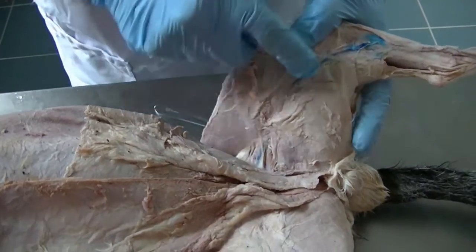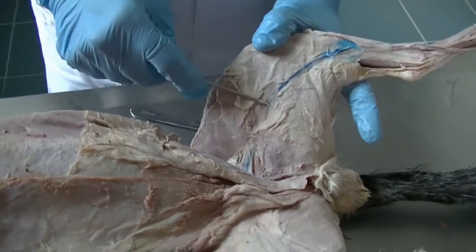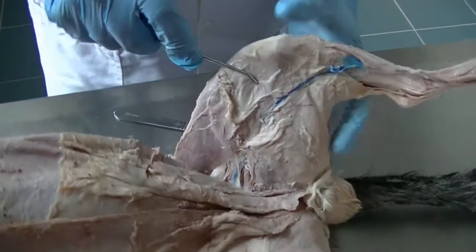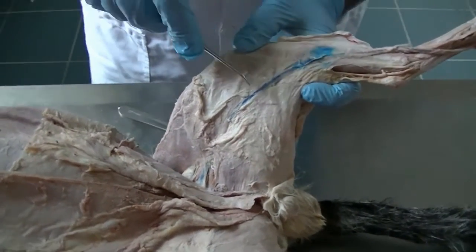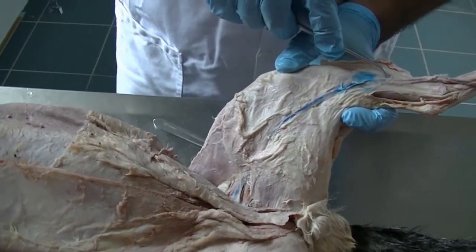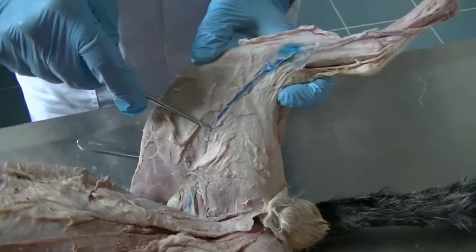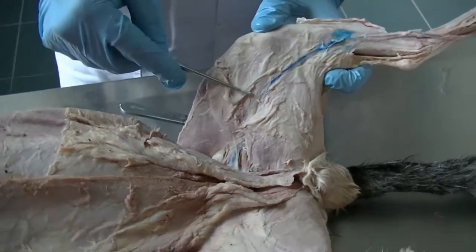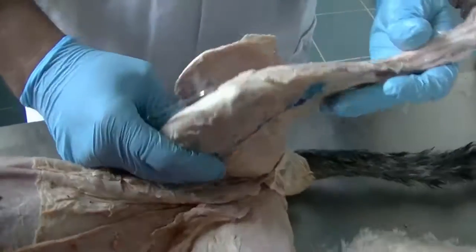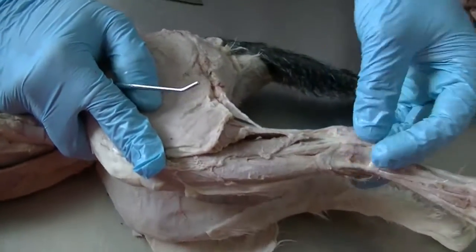The structure that we see here, apart from muscles, is the medial saphenous vein. In the dog, the medial saphenous vein is fairly small, while in the cat, this is much larger than the lateral saphenous vein, and that is the one which is always used for intravenous injections if we prefer to use it in the hind limb rather than using the lateral saphenous vein. The lateral saphenous vein is still present. It would be in the same form as we see in the dog.